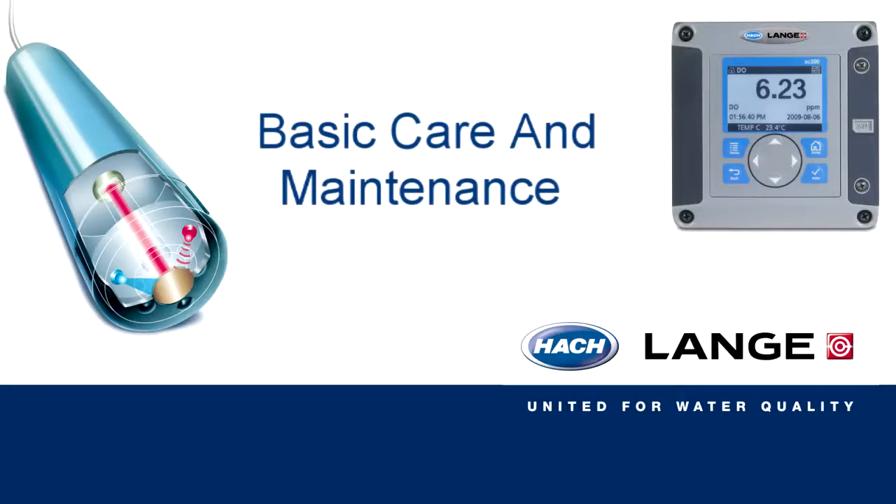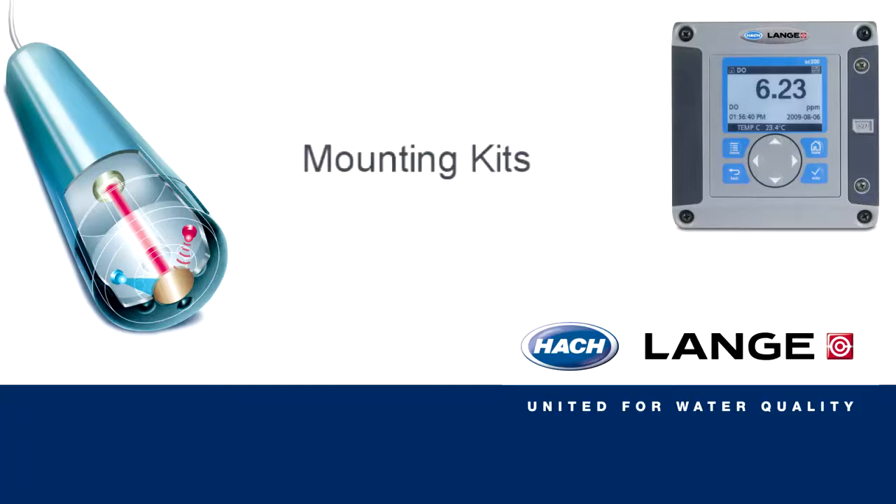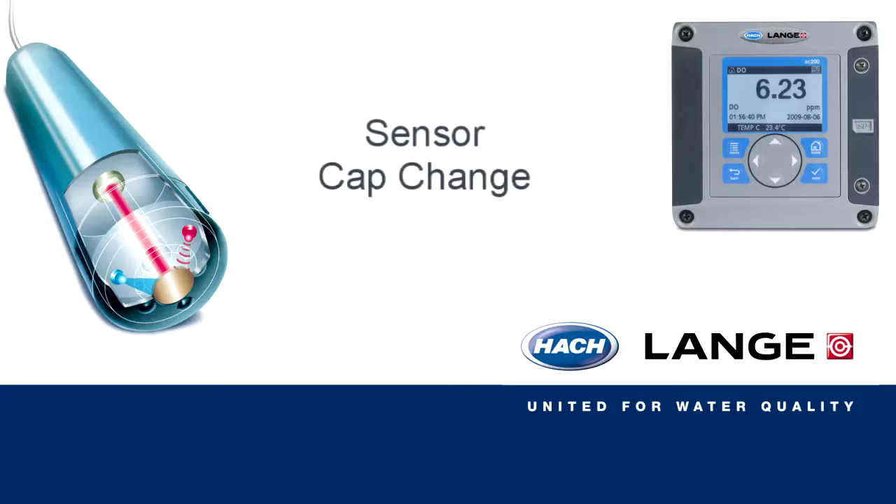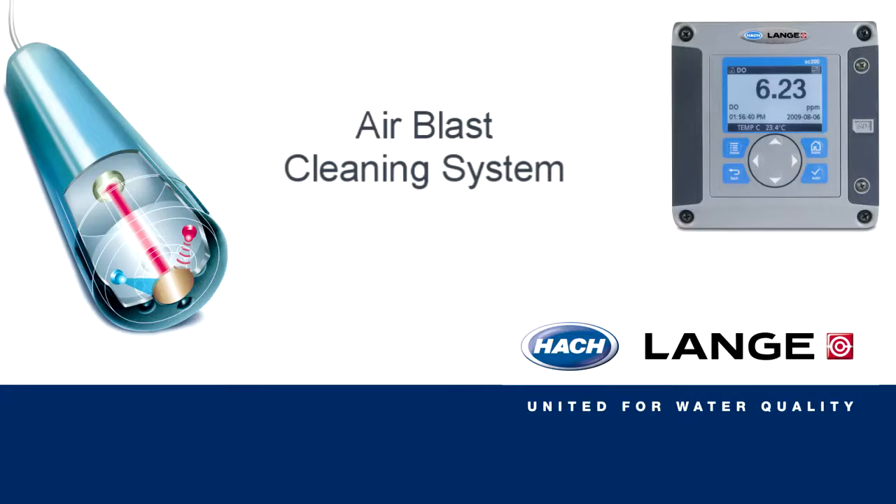In this video we will be covering the basic care and maintenance of our LDO probe. This will cover mounting kits, manual cleaning, warnings and errors, sensor cap change, and air blast cleaning system.